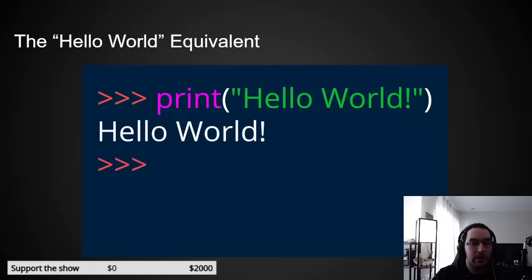Today we're going to be covering what I call the hello world equivalent. When you're first learning how to code, literally the first thing you do is print hello world. This is the same thing, because you got to start somewhere, and learning how to write DNA is kind of weird. It's a weird experience, and there's also no compiler, so unless you have the DNA made, you can't actually test it. There's not a quick compiler where you can just do the thing.